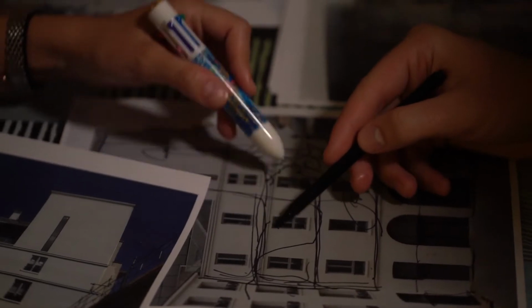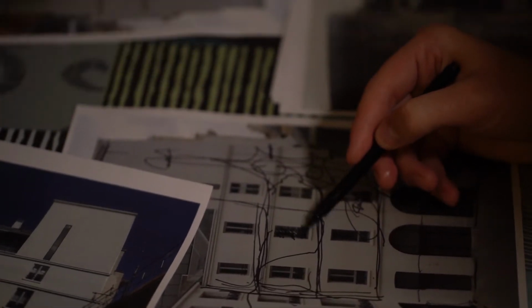We also wondered how they would react if, on the opposite, they would be constrained to attach to windows. We could then look in the cells and see how their architectures adapt to the one of the building.